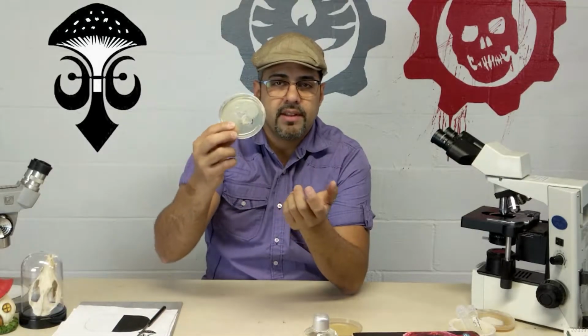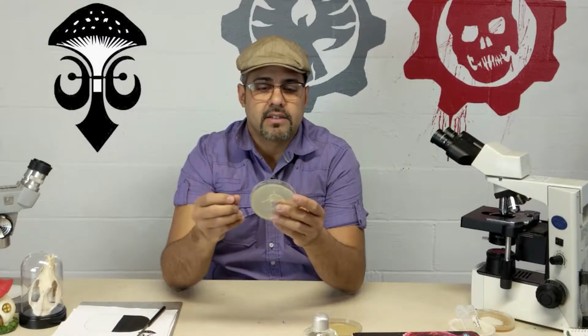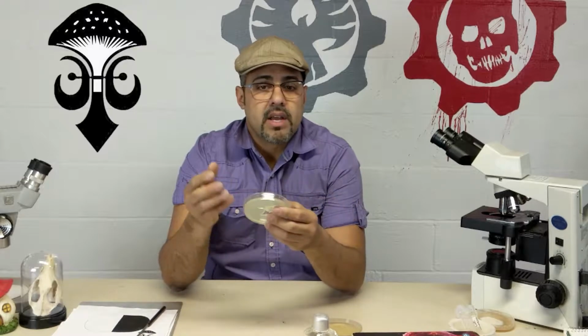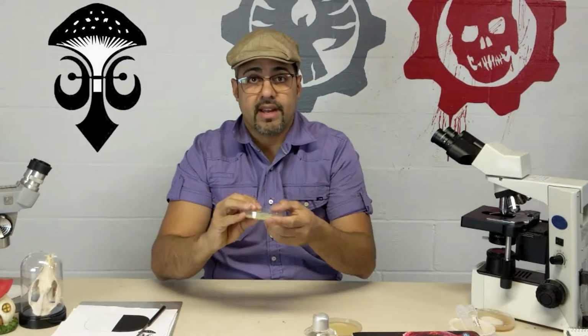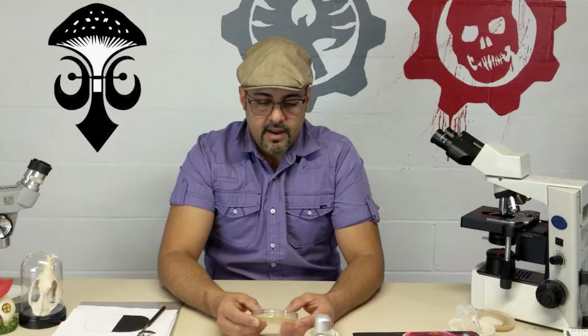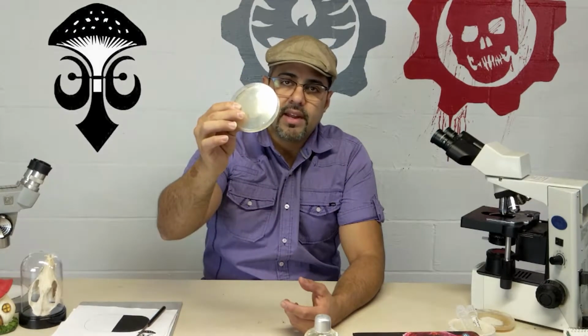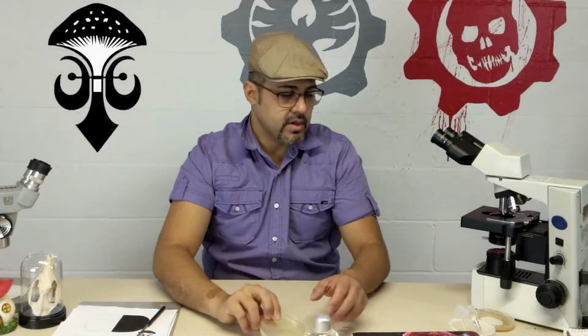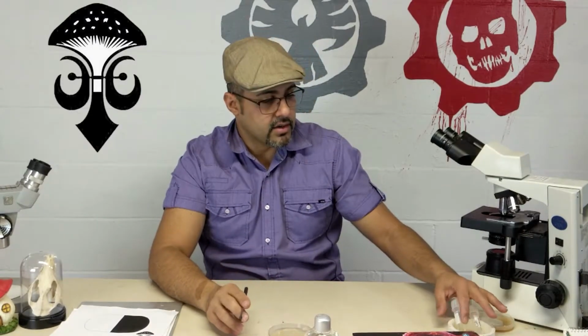So approximately we put in this type of plates, let's say 15 to 20 mils of that substance in there. That way we can actually grow the microorganism on top, and then we can actually observe them. So these techniques are for moving from one specific media, let's say that we imagine that we have bacteria in here, to move it into this plate. So you can actually see how the transfers are done.